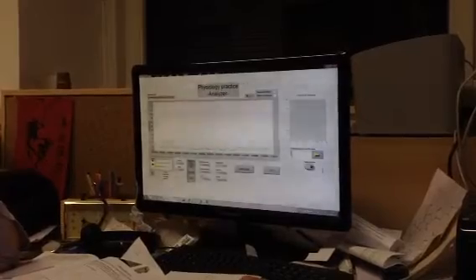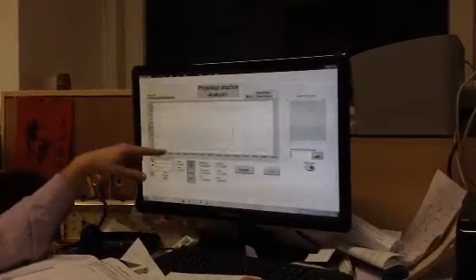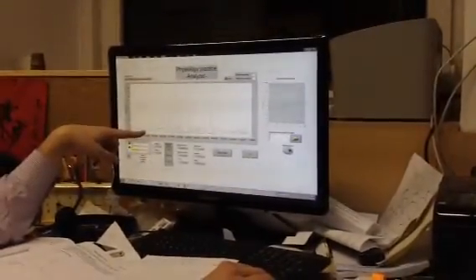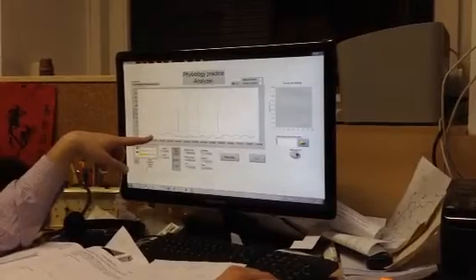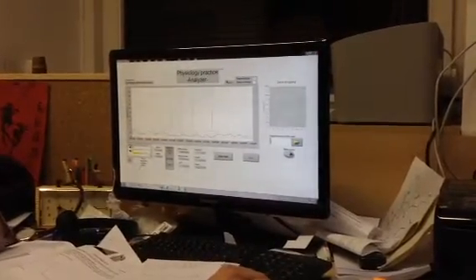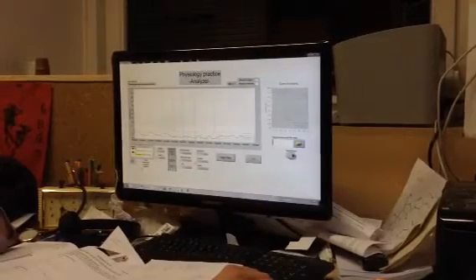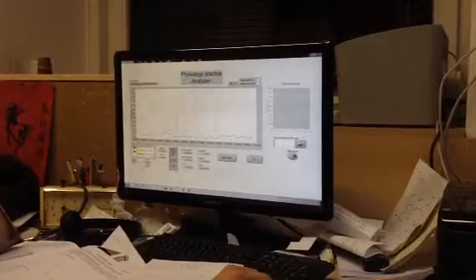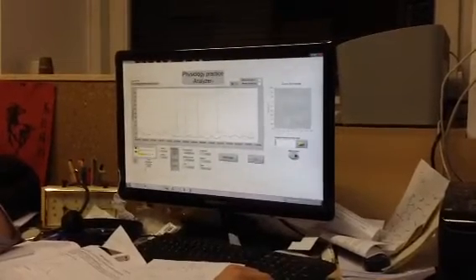The baseline also dropped. This is something you can describe by words. After the changes, you can see the contraction amplitude, not just measure it, and the frequency. But the others are the same. Integral, slope, TTP. What is TTP? It's time to peak.